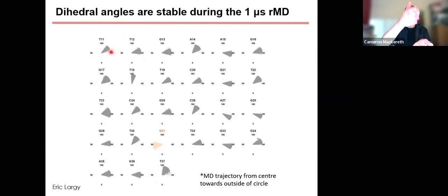So basically how the base is positioned with respect to the sugar. Usually they are all anti, but there is one guanine that is a syn, where the base comes on top of the sugar, and actually it follows the NMR spectrum, which has unusual chemical shifts or positions in the spectrum, so it all makes sense. It fits the NMR data as well.